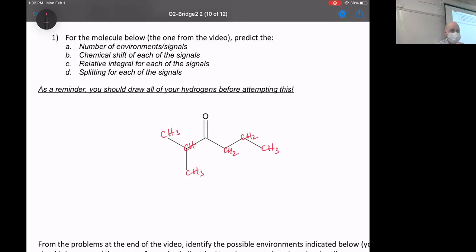And then if it's at 3 ppm, what does that mean? The chemical shift, the ppm, tells you about proximity to nearby functional groups, specifically if it's around 3: nitrogen, halogen, or oxygen. So probably one of those things next door. All of those things are telling you different things. They're all simple, I think, taken one at a time, but you do have to consider them all together, so it's really easy to get confused. Try your hardest to keep them separate from each other.